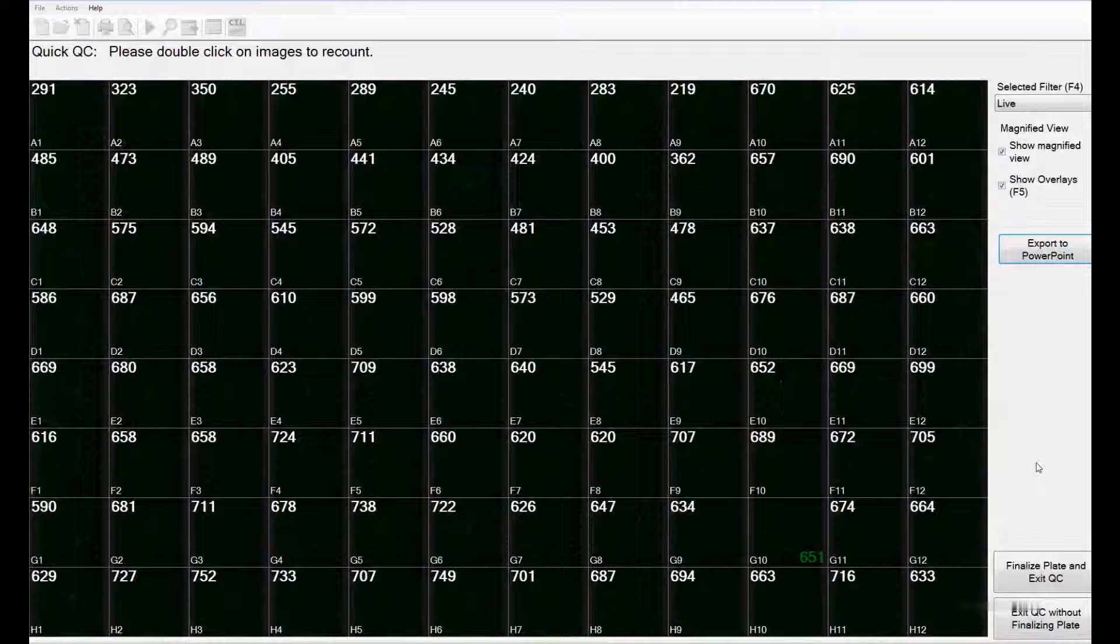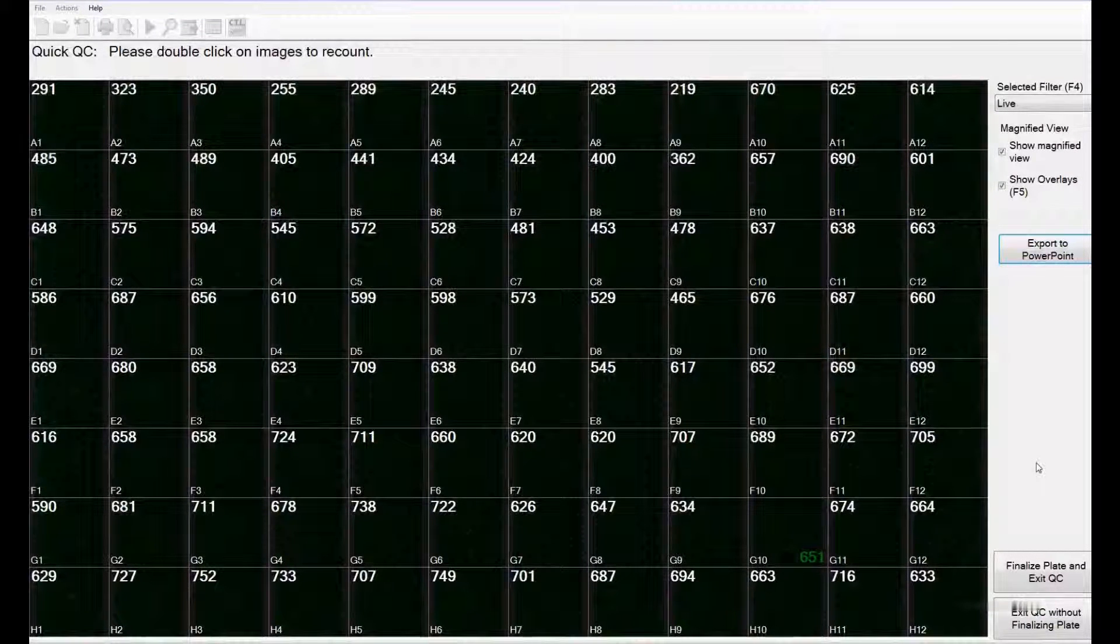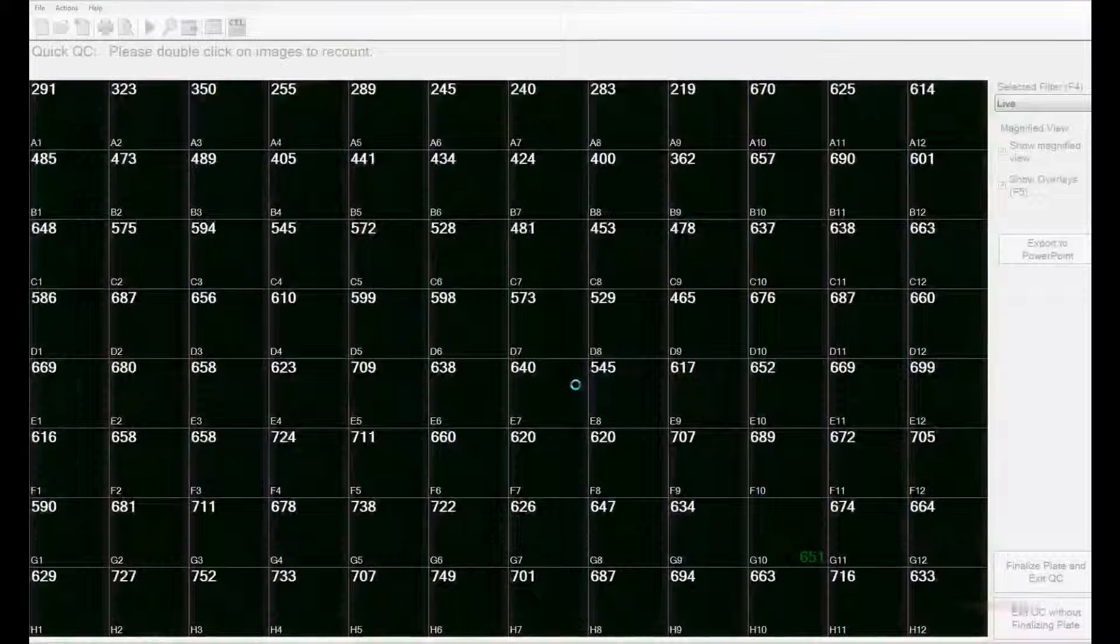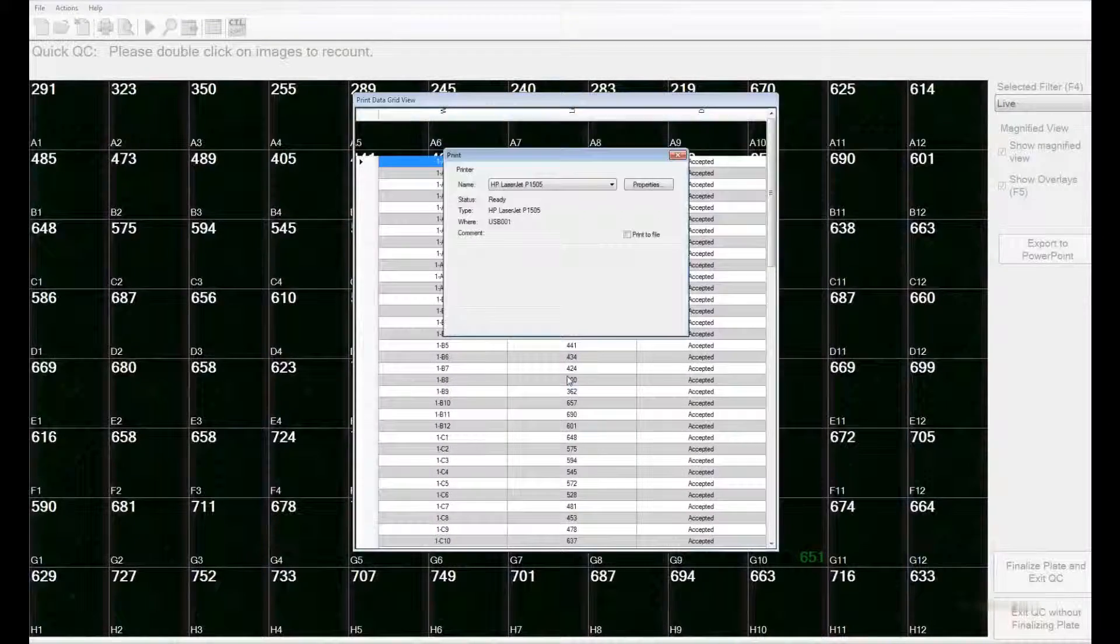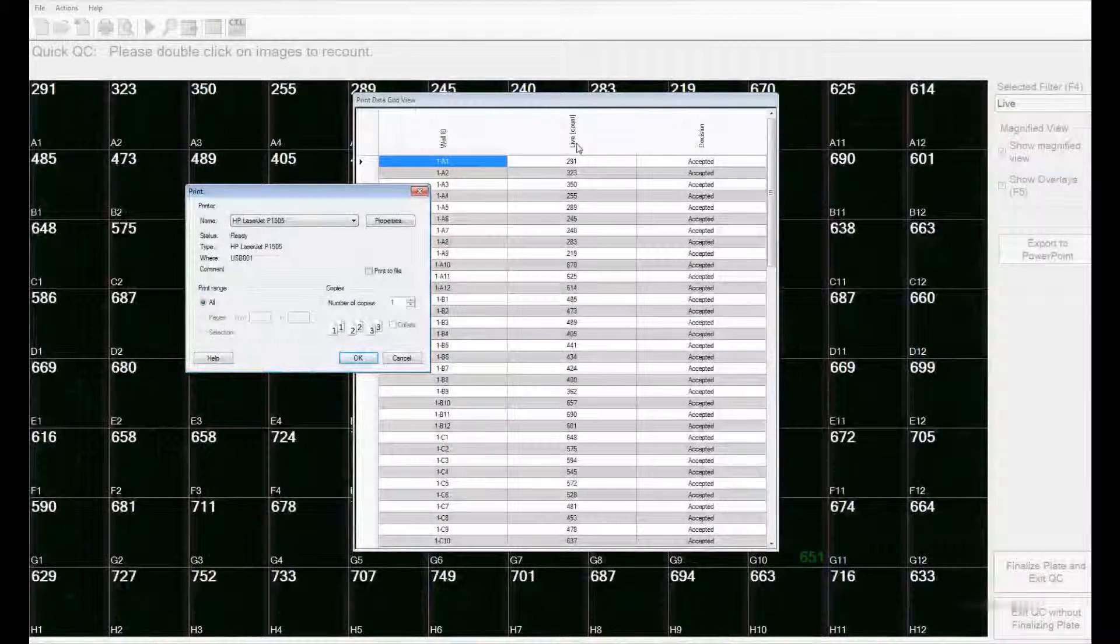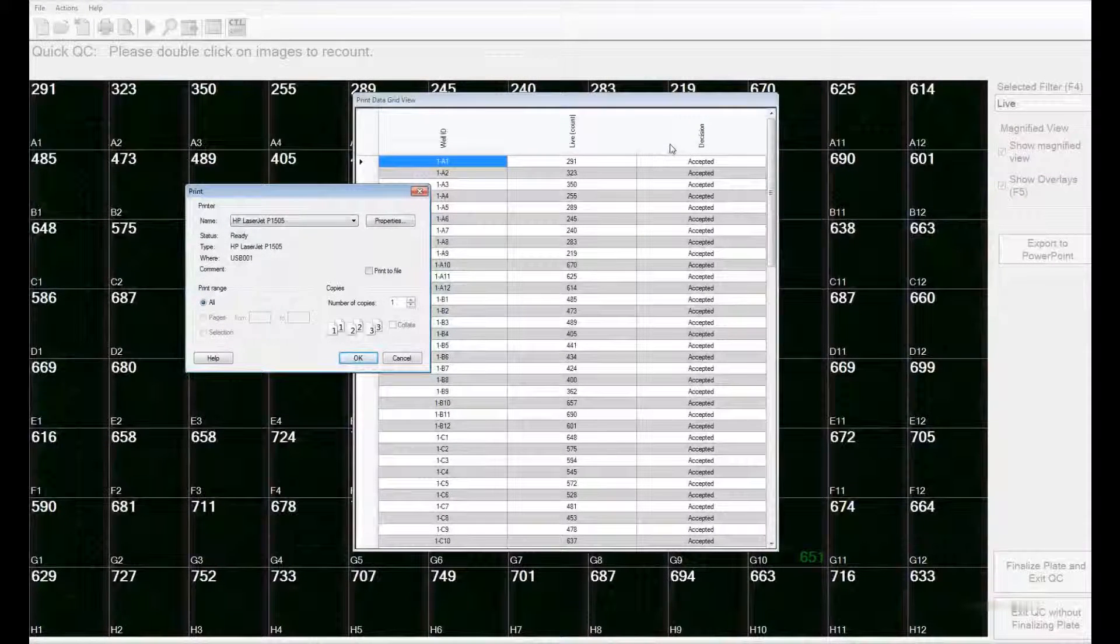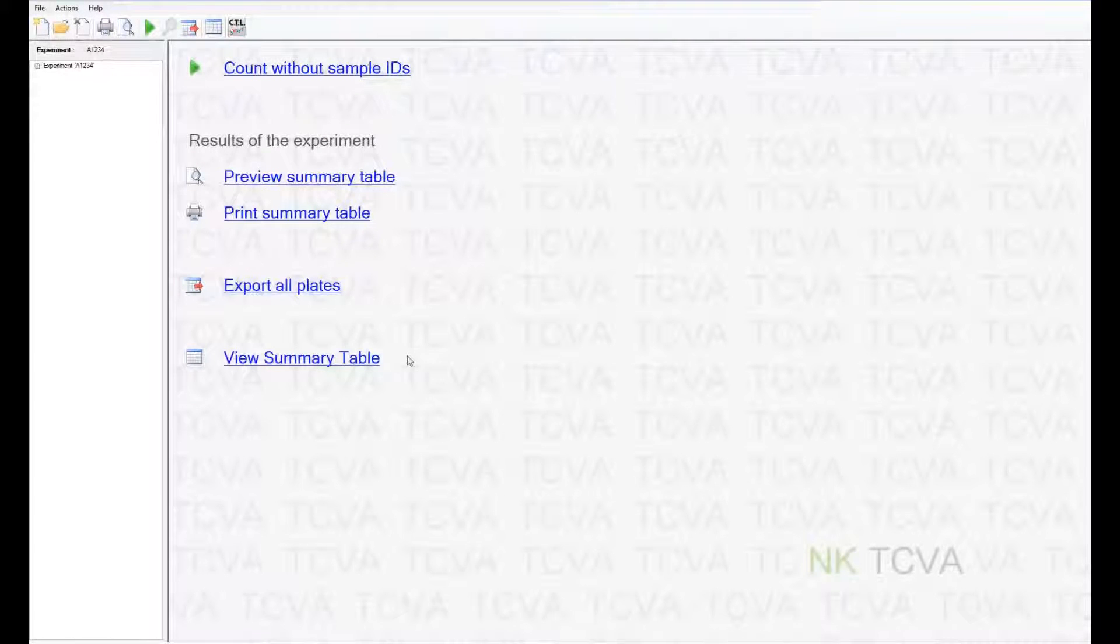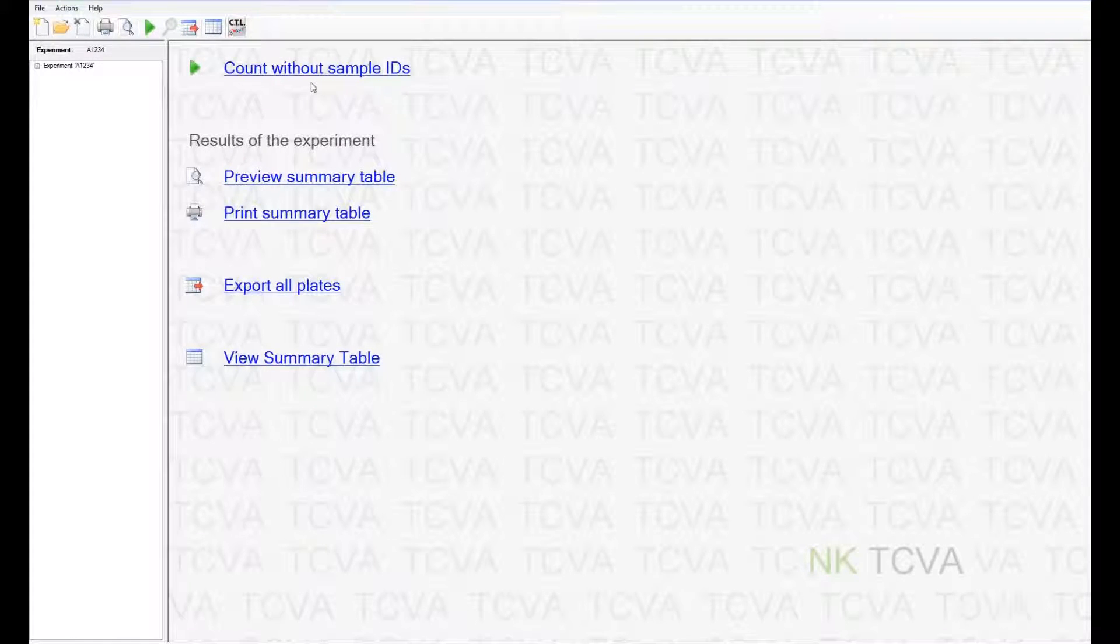If you are satisfied, you can finalize this plate and the entire set of images. Once you confirm this, you can then print the data set right there. The printed version gives details on the well ID, the live count, and the decision whether this was accepted or rejected. After you are done with this plate, you can either add more samples or you can view the results of this plate.